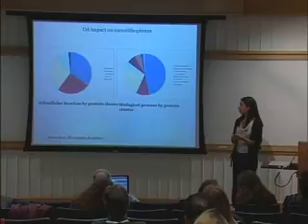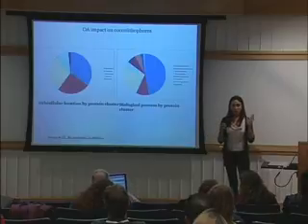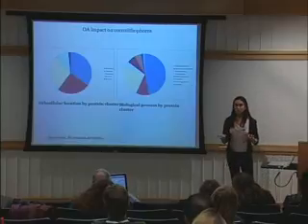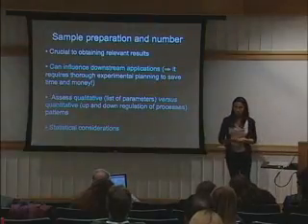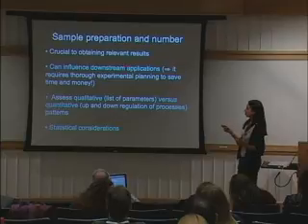But what we are doing now is looking at two conditions. So instead of different cell lines exponentially growing, we look at the same cell line under two conditions. So what we hope is that we will find some interesting protein expression associated with one condition or the other. So the way we prepare the samples is really important to obtain relevant results. And it's important for the applications that you are going to use later on.